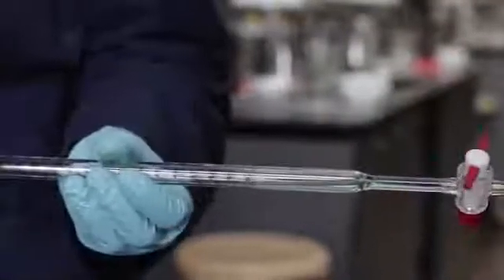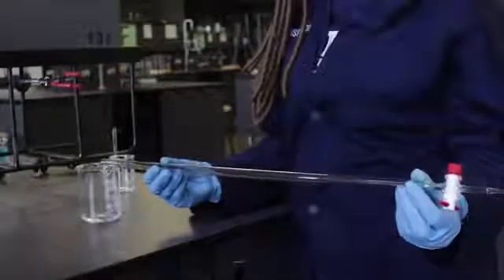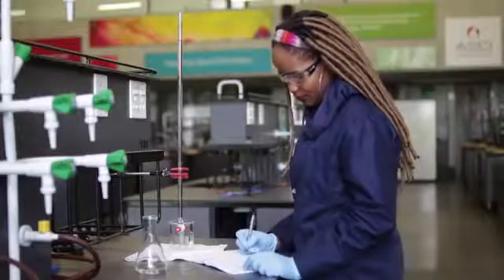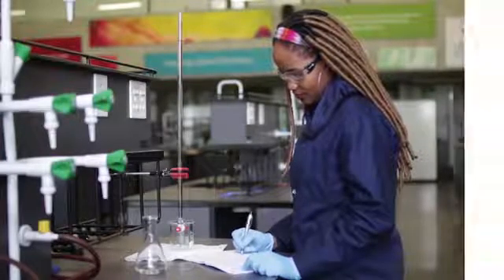The burette has now been cleaned and prepared as shown in the previous videos. The meniscus is level with any graduation mark on the burette between 0 and 2 milliliters. The initial reading will be recorded, remembering to do it to 2 decimal places.